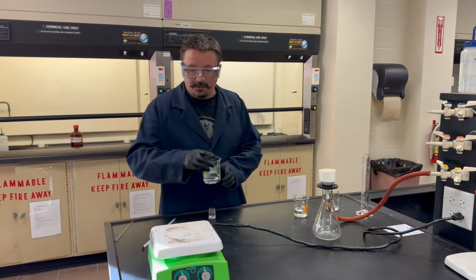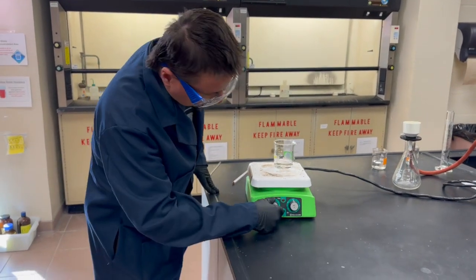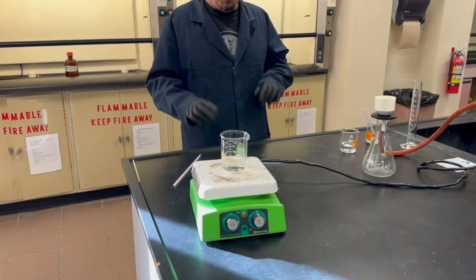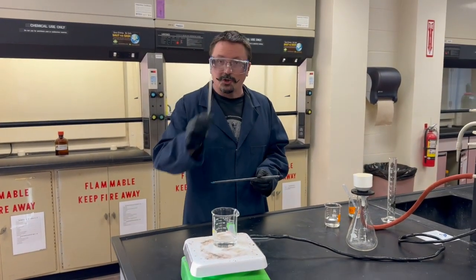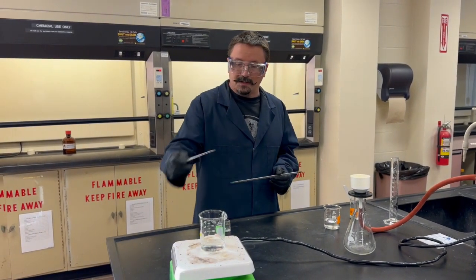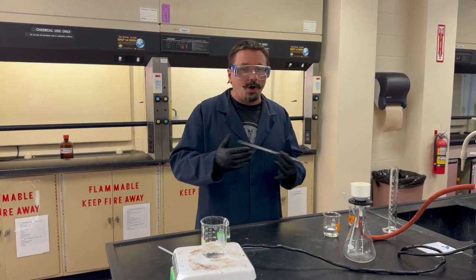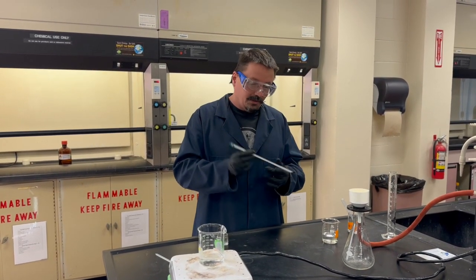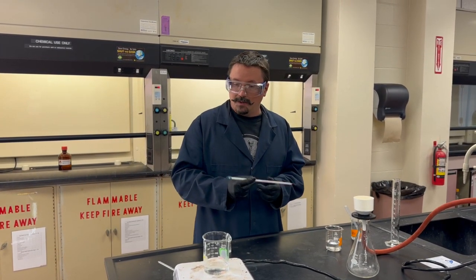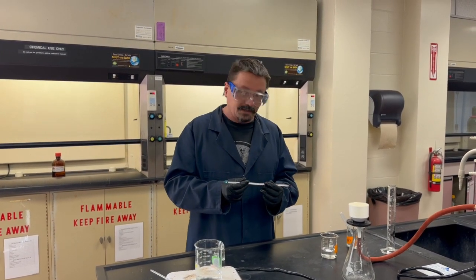Once you've done that, put it on a hot plate and start heating it up. We want to get it hot — close to boiling but not actually boiling. Stir with a stir rod to keep it homogenous and make sure it's completely dissolved. You do have a thermometer in your drawer, so once you're at about 80–90 degrees that's good and you can move on to the next step.